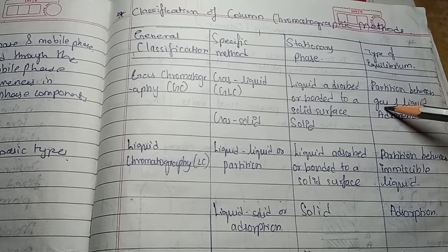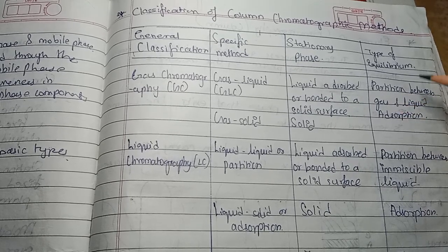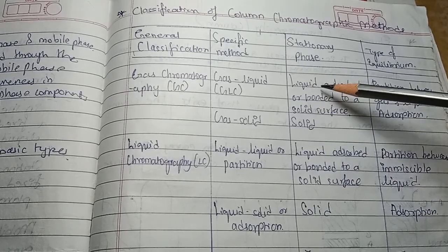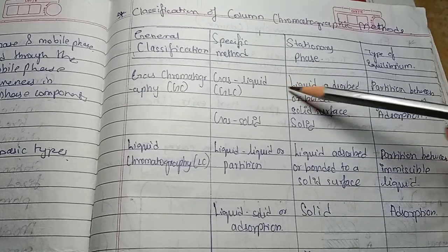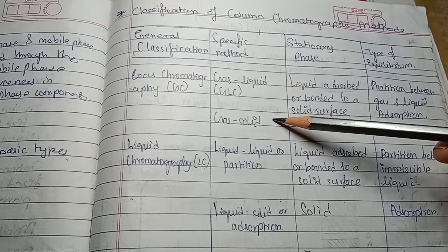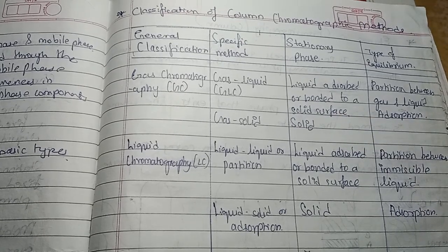Of course, the mobile phase used in gas chromatography will be the gas, but the stationary phase might be different. In GLC, the stationary phase will be in liquid form, and in gas solid, the stationary phase will be in solid form.